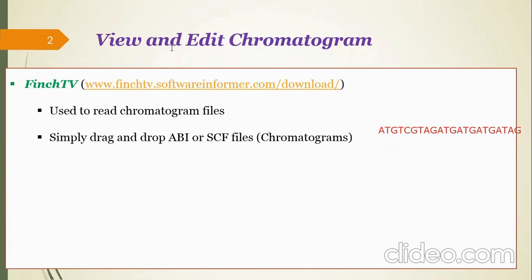Initially, in the lab, we have DNA or RNA, total DNA or total RNA, and we need to amplify the target DNA from the total DNA or from the RNA. From the RNA, we did reverse transcription, and after that we get the cDNA, and then we do PCR. In the PCR, we use two primers: one is the forward primer, and the other is the reverse primer.